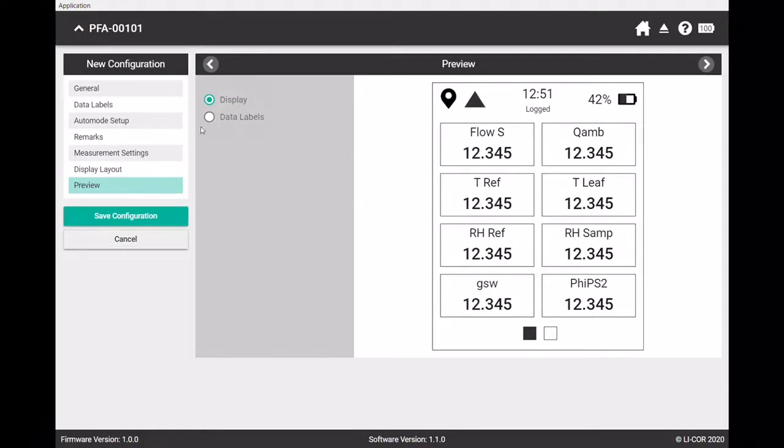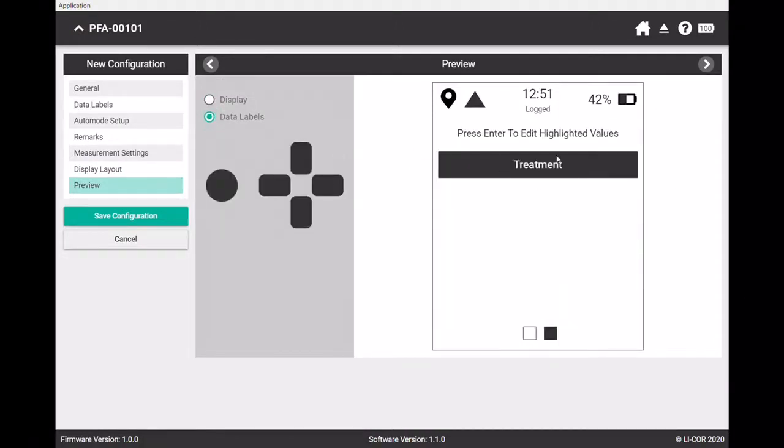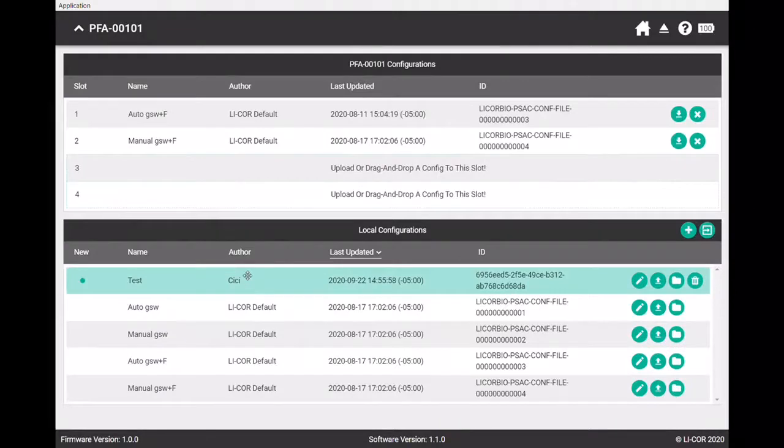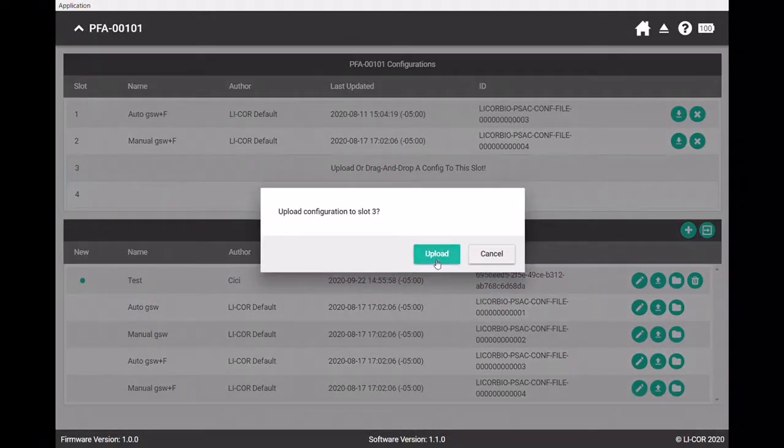And then we will go to the preview. This all looks good. I have my data label, I have my treatment set up for my barcode. Ready to save configuration and then upload this configuration to my instrument.